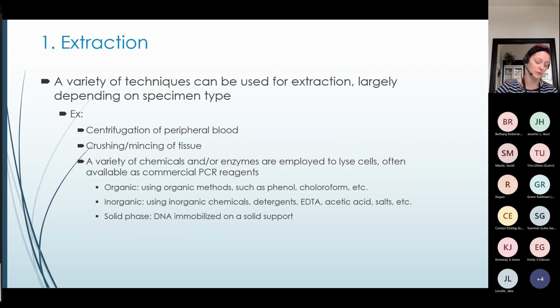Everything that we do in the lab currently, all of our extraction methods, are automated and we buy kits to do it. We used to do manual extractions. Cytogenetics took over our manual extractions once COVID hit. There are still kits that they purchase to do it, but they have to do lots of manual processes. They're adding each reagent, spinning stuff down, then adding another reagent and spinning stuff down to purify it, as opposed to using these automated extractors that use magnetic glass particles and such.